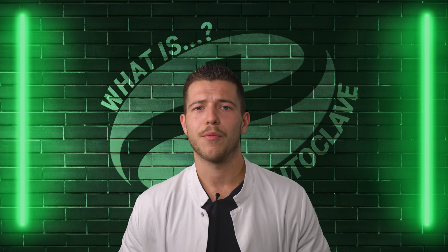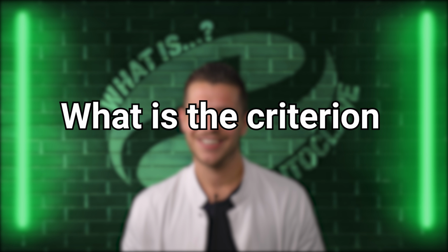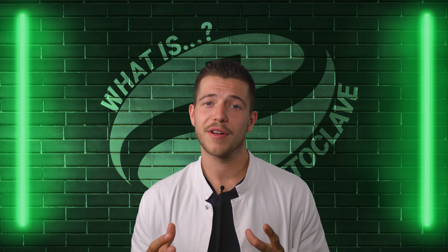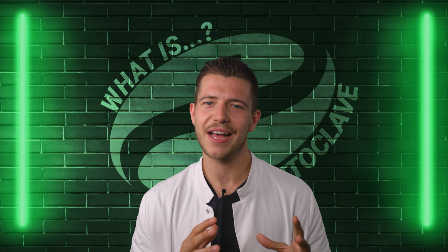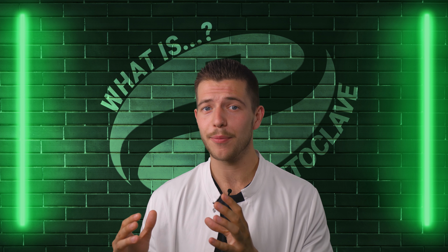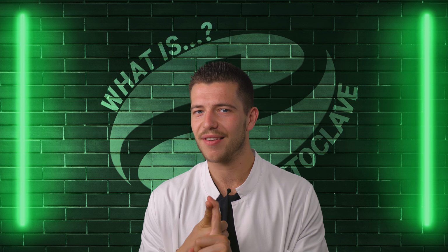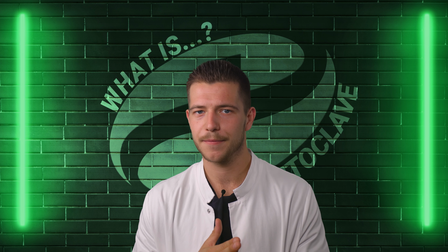And there is where we want to ask the third and last question. What is the criterion for a correct solution? Autoclaves differ in various characteristics according to their field of use. So you need to be sure which kind of material you're going to treat, and afterwards you have to consider the application size and volume, the power and installation, and the orientation of the chamber or the loading.